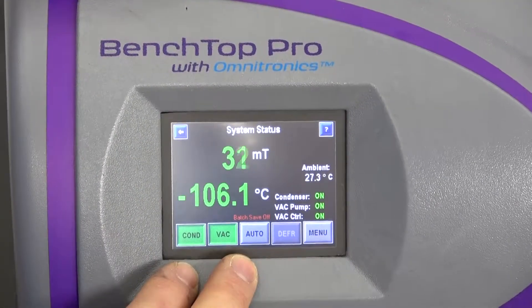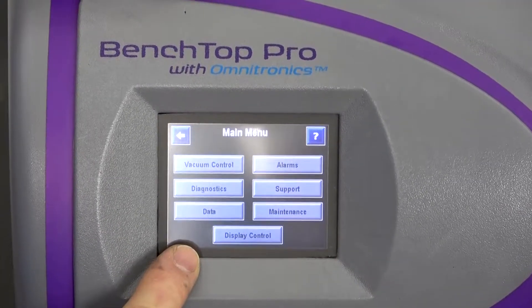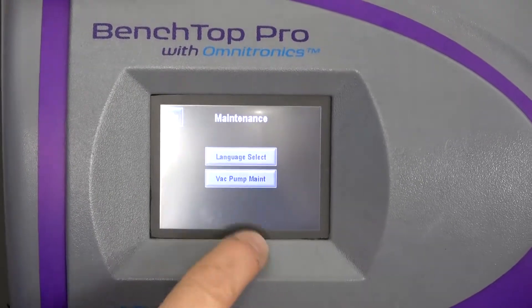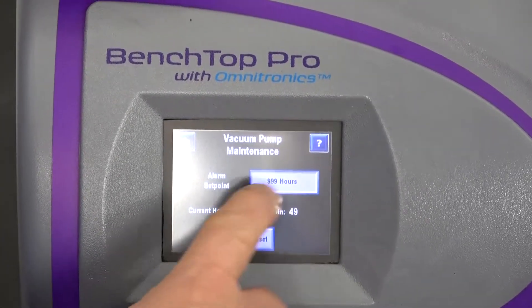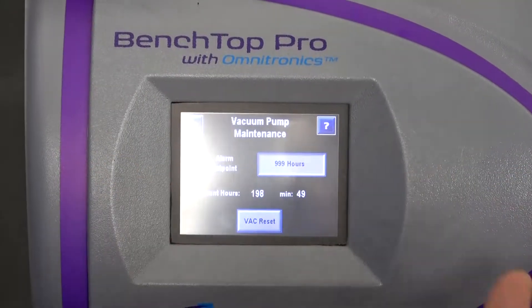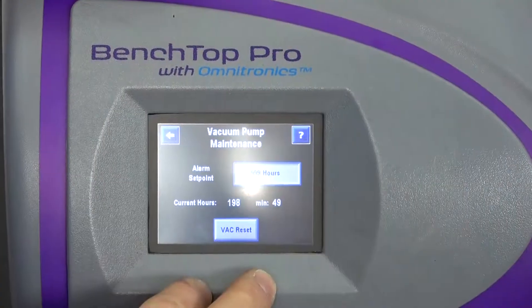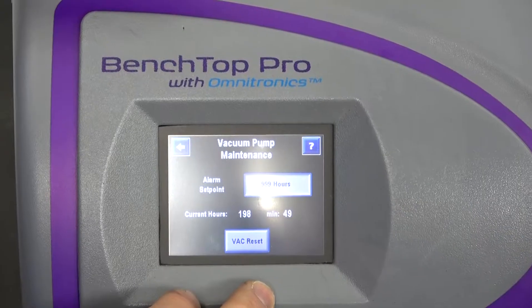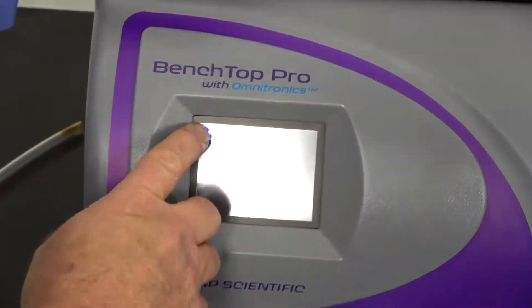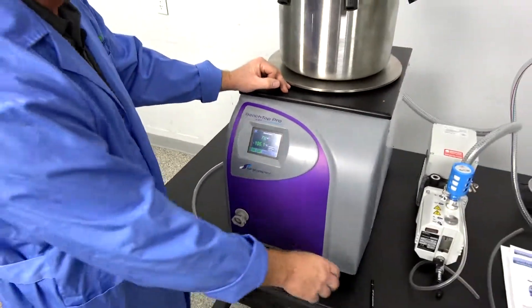I'm just running manual settings, but you can go in and set up your menu and run your programs in here too. Under maintenance you can keep track of how many hours are on the oil changes on your vacuum pump, so you can set those to remind you to change them. We also have the quick and easy way to change the oil, which makes it very convenient. Just a lot of nice features — the touchscreen works awesome and it does have the stylus pen too that came with it.